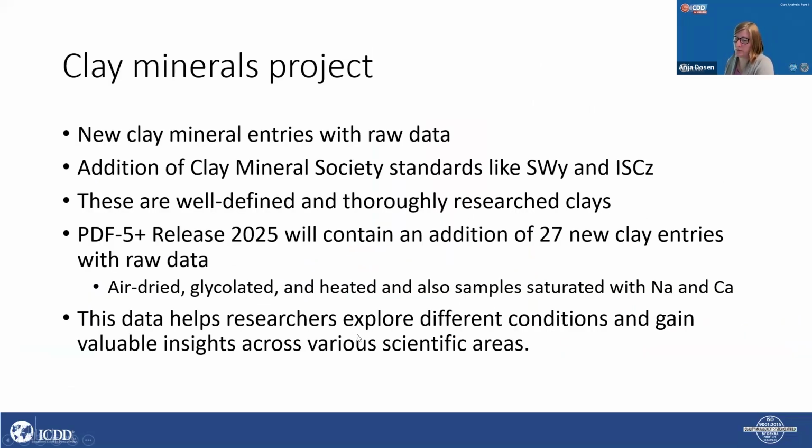This clay mineral project, as I mentioned, we're coming up with new entries. We are adding currently 2 clay mineral standards, which are Wyoming smectite, this is SWy, and ISCz, this is an illite smectite from Czech Republic. These are really interesting to have because they are very well defined.